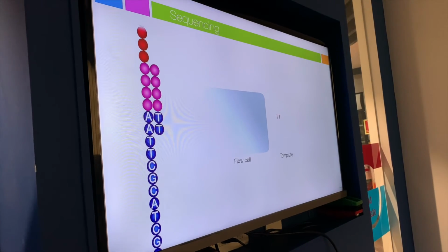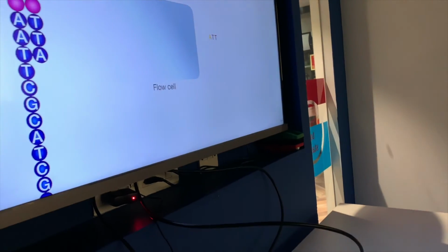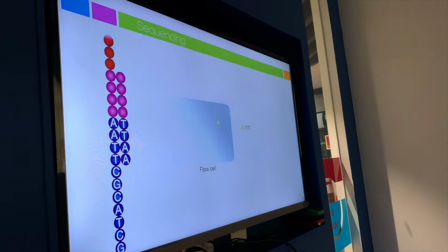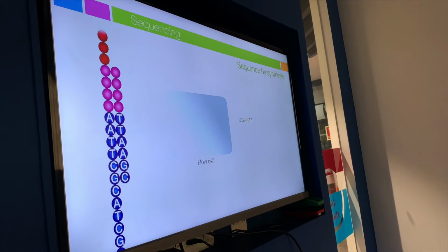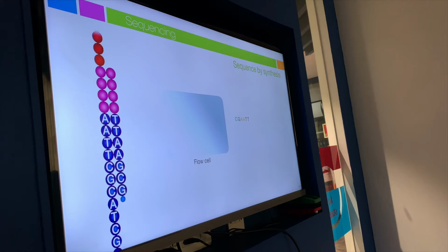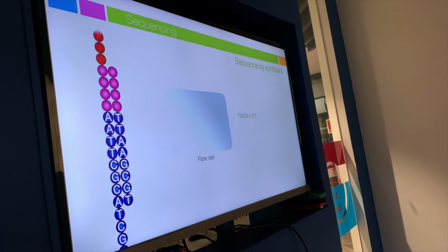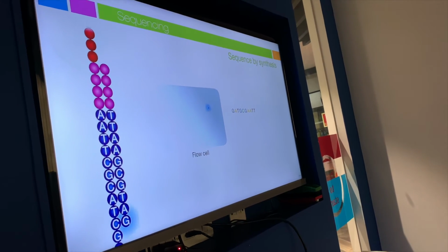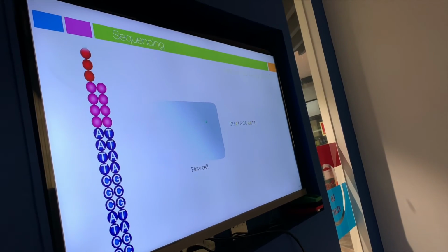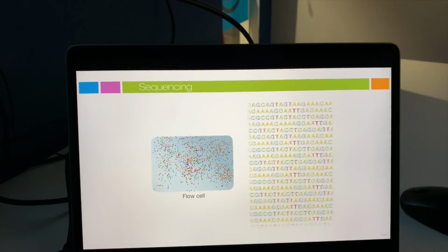After the addition of each nucleotide, the clusters are excited by a light source and a characteristic fluorescent signal is emitted. This proprietary process is called sequencing by synthesis. The number of cycles determines the length of the read. The emission wavelength, along with the signal intensity, determine the base call. For a given cluster, all identical strands are read simultaneously. Hundreds of millions of clusters are sequenced in a massively parallel process. This image represents a small fraction of the flow cell.